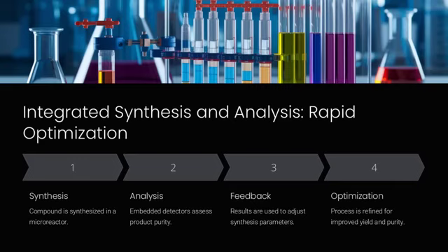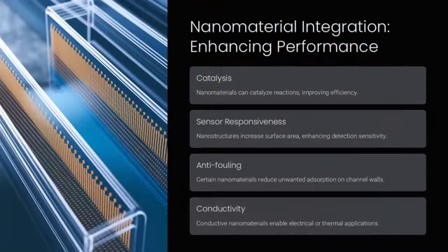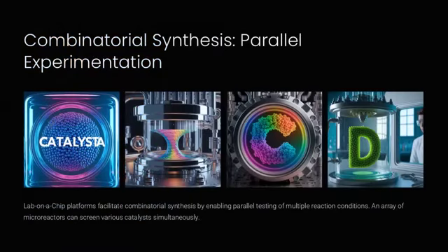Acoustic actuation leverages high-frequency sound waves to create localized pressure variations that drive fluid movement. For example, surface acoustic wave (SAW) devices rapidly mix reactants in a microreactor, much like ripples from a pebble tossed into a pond stir and blend the water.